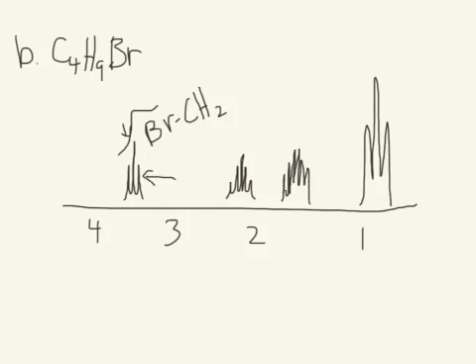near to 4. And we can figure out what that CH2 is bonded to on the other side by looking at the splitting. If there's 3 peaks, there's one less hydrogen on the neighboring carbon. So, must be CH2. Alright, now let's look at the right side and work our way in.